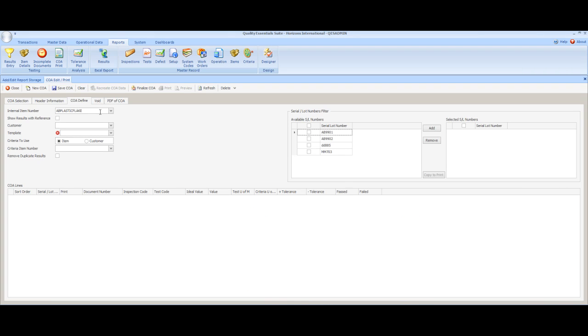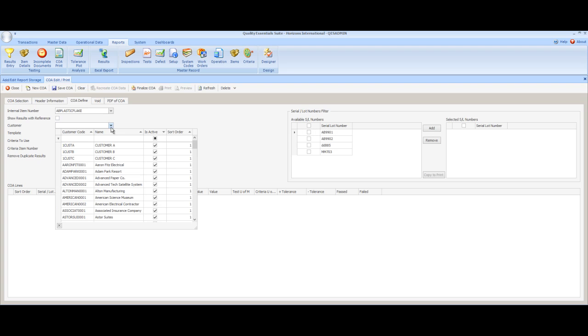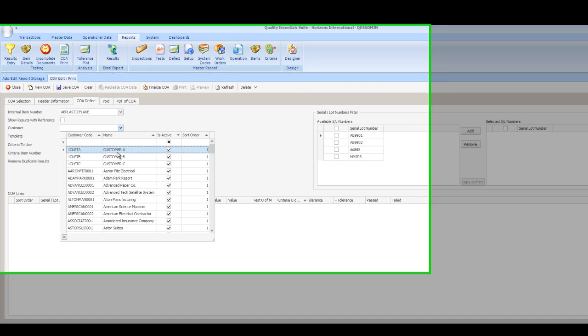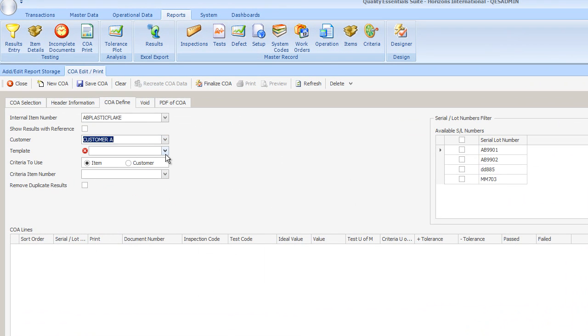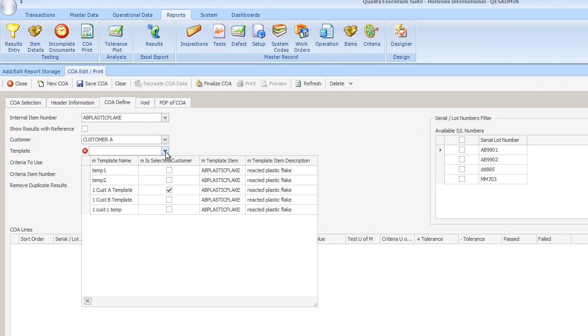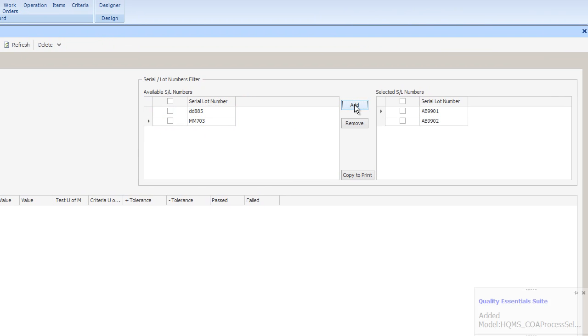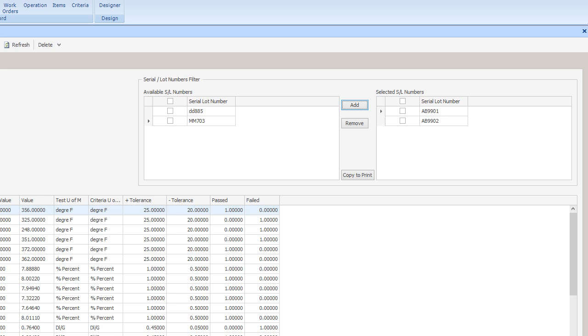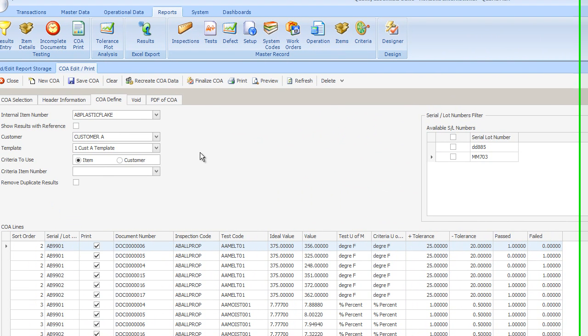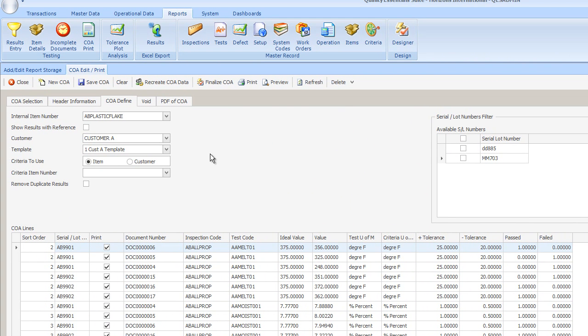Another default report layout that is very useful is one that shows the average values, the mins and the max, that were collected during the production run. We'll start again with our AB plastic flake. This time we'll go ahead and we'll select customer A as our customer. And we'll look for the template that matches customer A. You can see that it's marked in the drop-down list. It isn't necessary to always have a customer. If we're going to be sending the same C of A to multiple customers, we might choose to leave that information off the header. We're going to select two lots of material that are going to be shipped to customer A. And then we're going to go look through our database for the relevant data that represents the performance of these lots.